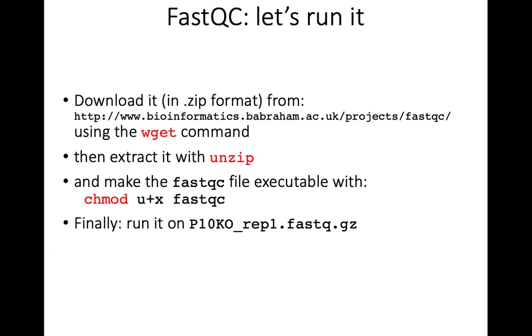I mean, first of all, what you probably want is this. So this exists, right? And then I'm not sure what you have here. Was this a copy of the data workshop file? So what if I want to analyze the data here? I can use my own data.